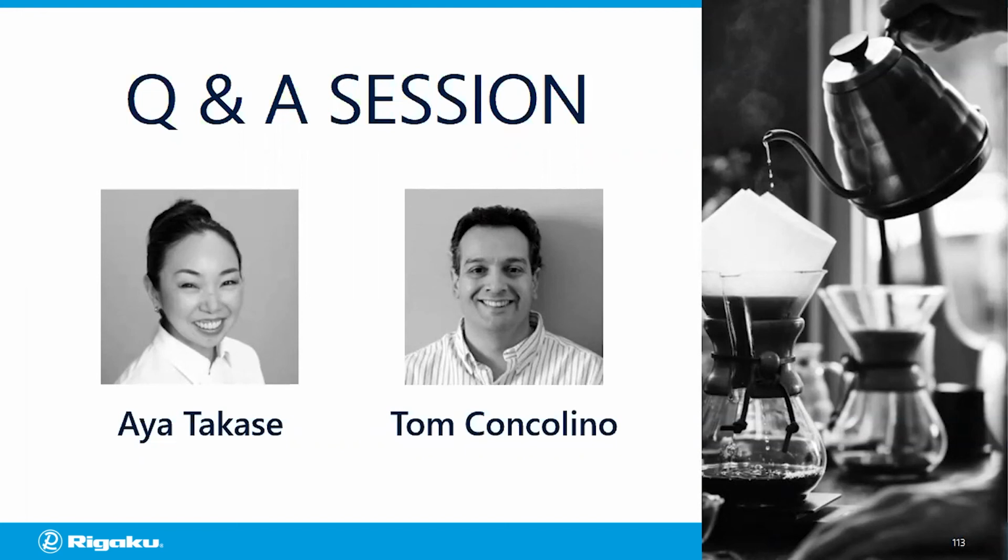Okay, very good. Excellent. Okay. And our next question is from Sarah, and she asks, how does a cone beam configuration affect the measurements?